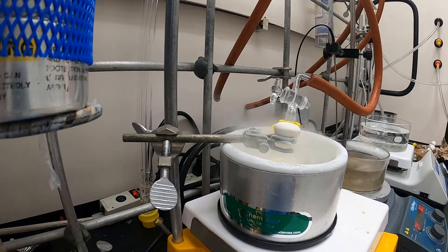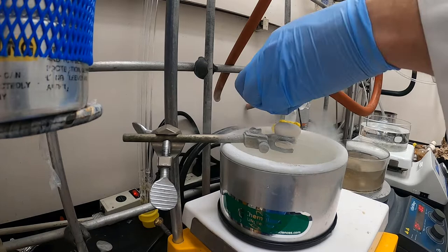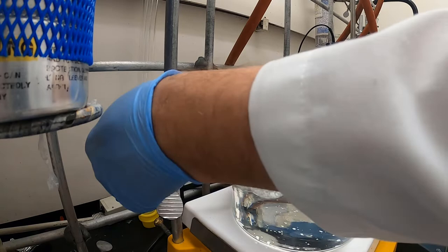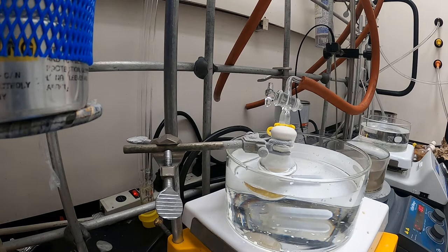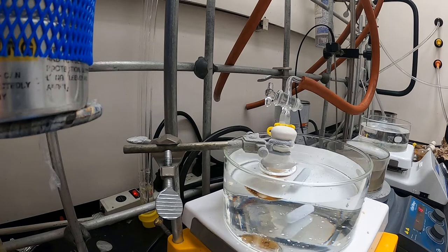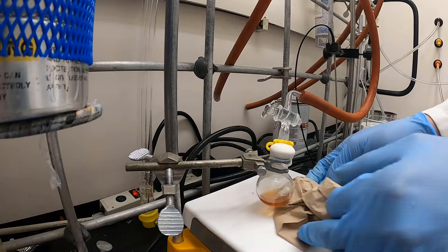At this point, I apply vacuum one final time and notice that my vacuum gauge needle did not move, indicating the flask was thoroughly degassed. While the reaction mixture is still frozen, I backfill the headspace with nitrogen and then thaw the flask one last time. You'll notice now the reaction mixture has that dark red-brown color that I described earlier in the video.